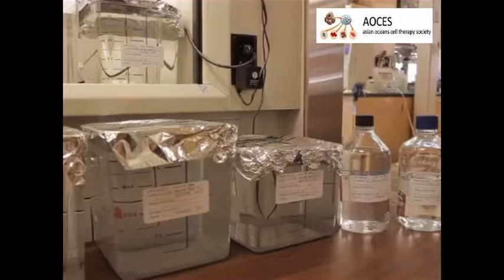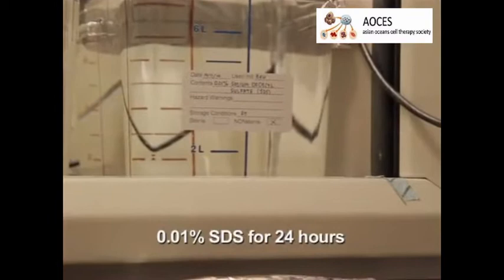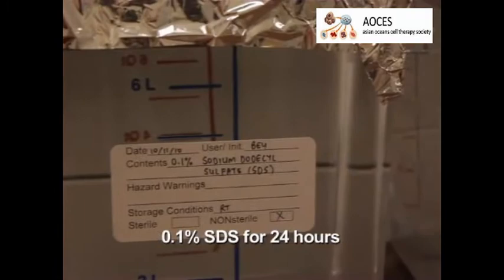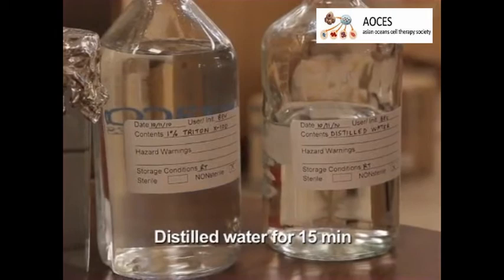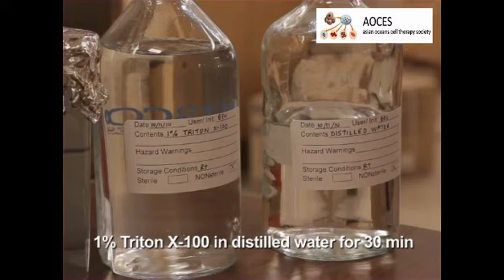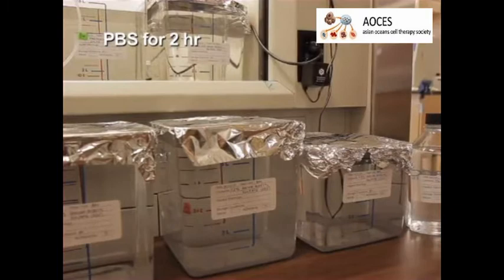Then perfuse the liver with the following series: 0.01% SDS for 24 hours, 0.1% SDS for 24 hours, 0.2% SDS for three hours, 0.5% SDS for three hours, distilled water for 15 minutes, 1% Triton X-100 in distilled water for 30 minutes, which will remove any bound nucleic acids, and finally PBS for two hours, which will wash the decellularized liver matrix, or DLM.